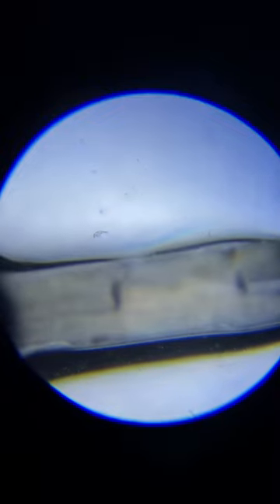We're getting into where it's sporulated, and this is the debris that it's working on. I wanted to see if I could check out the septa and see if it was beneficial.